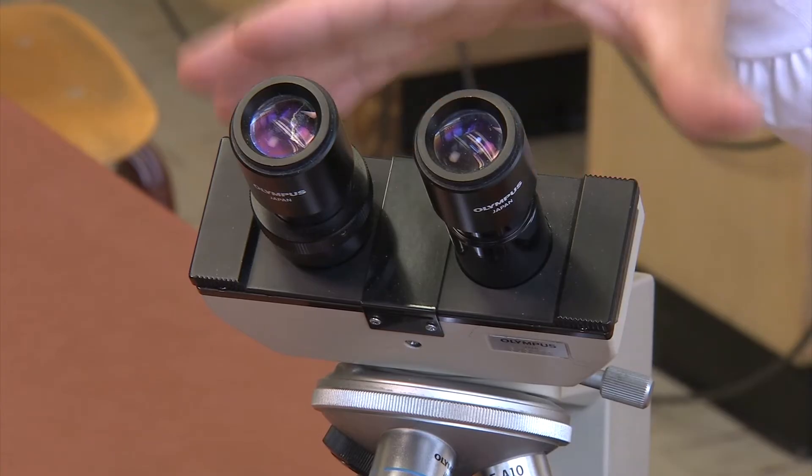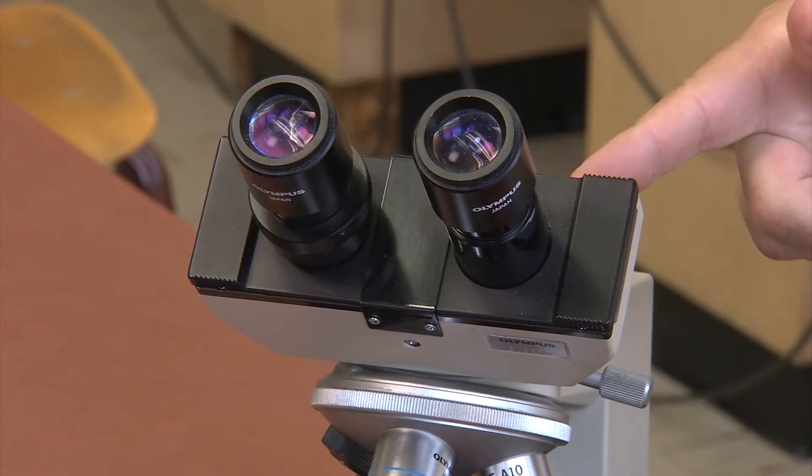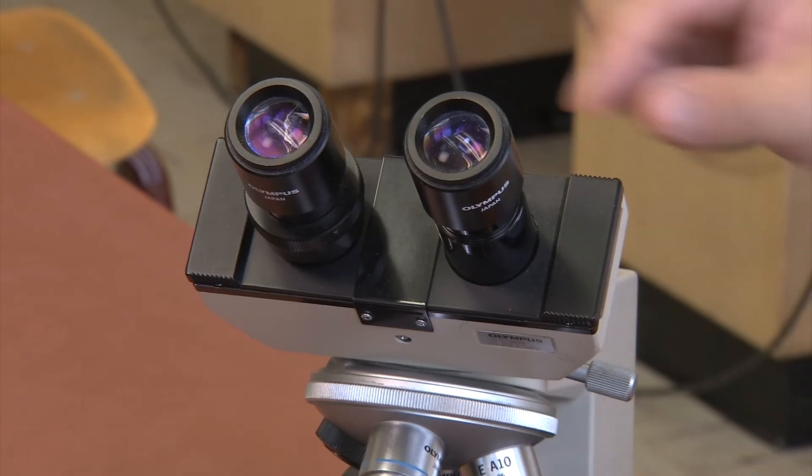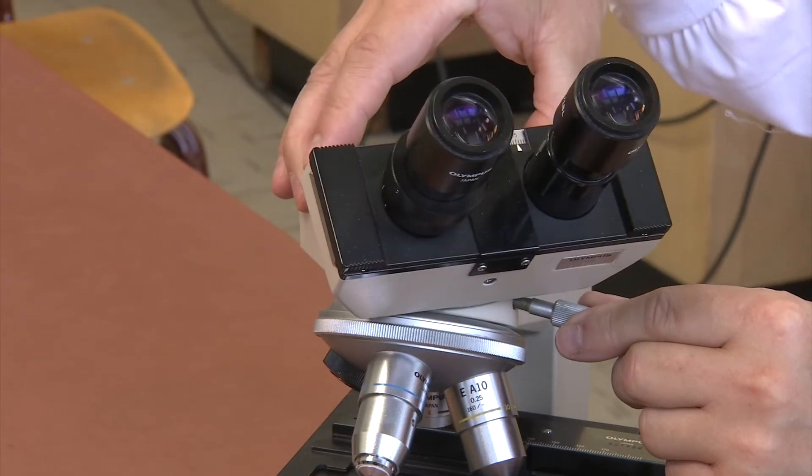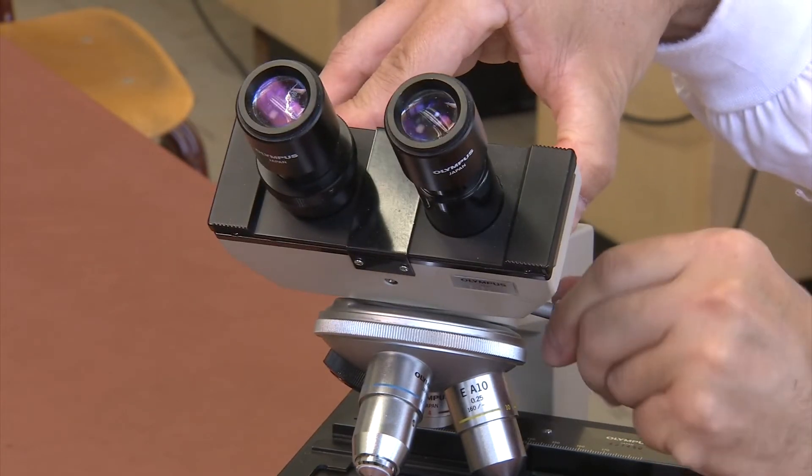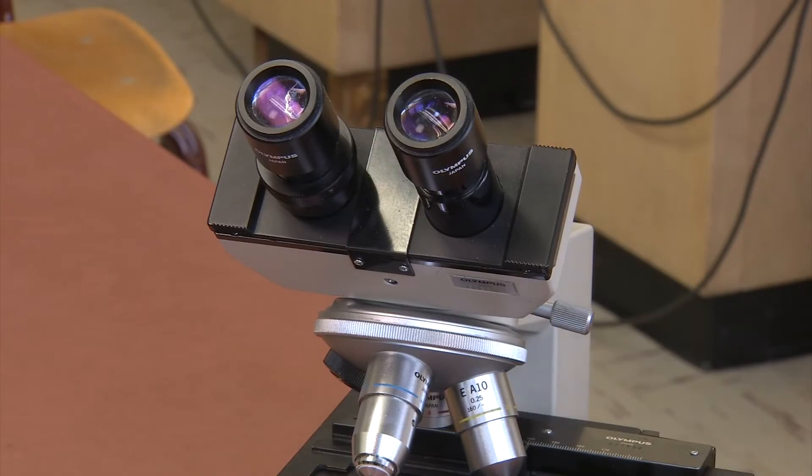The oculars and interpupillary distance scale are located on the top of the binocular tube. At the side may be a clamping screw. Loosening this allows the binocular tube to rotate. For the purposes of this lab, the clamping screw should be left tight. A loose binocular tube can damage the microscope or your sample.